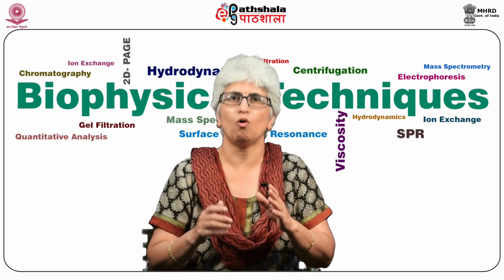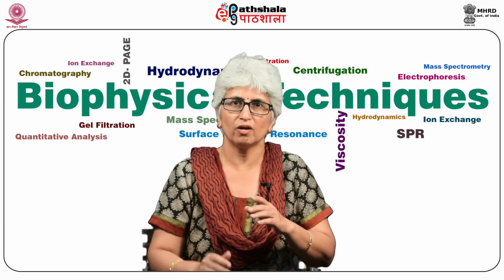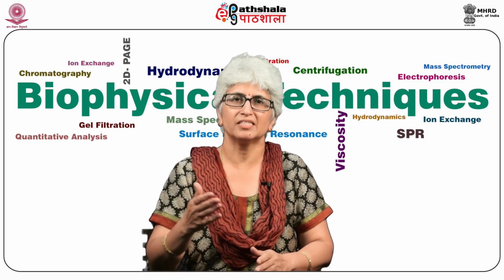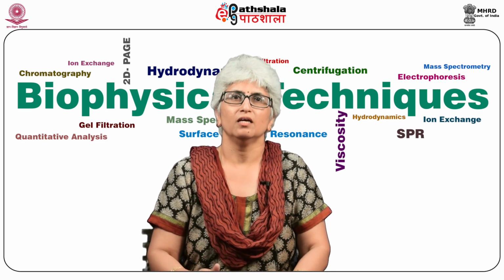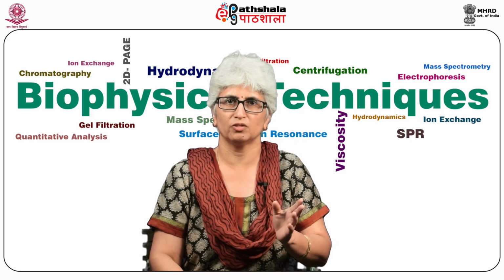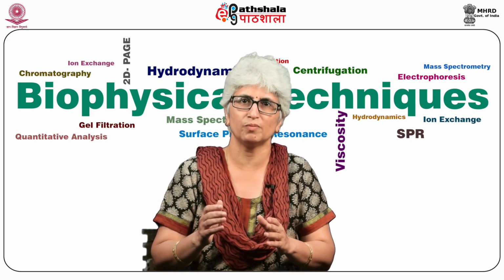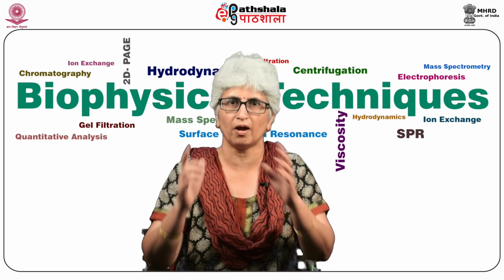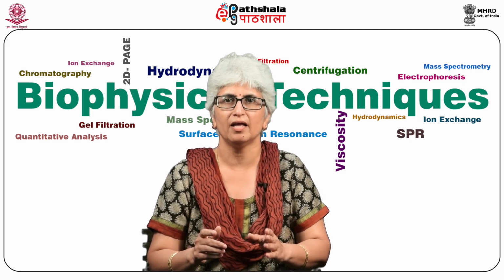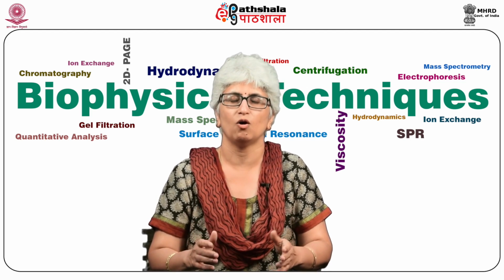Chromatography is a preparative or analytical lab technique used for separation of complex mixtures. Chromatography is routinely used in various fields such as chemistry, physics, medicine, microbiology, and pharmacology. Chromatography was discovered by M.S. Tswett in the beginning of 20th century. The word chromatography came from Greek meaning color writing, as the method was based on the colorful picture of separation of plant pigments. The description of similar separation processes was given by L.S. Palmer in the United States and Day in Europe, almost 10 years after Tswett.